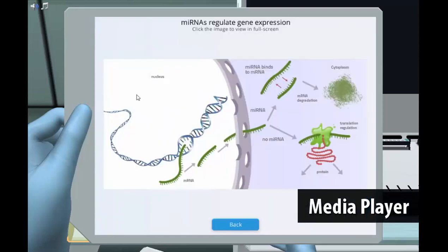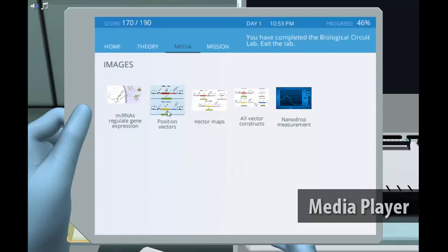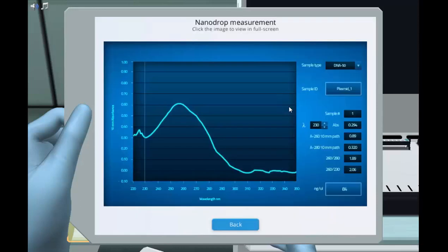Also, with the media player function, students will be able to see the animations, graphs and collected data several times during the lab, as well as at a later time for exam preparation.